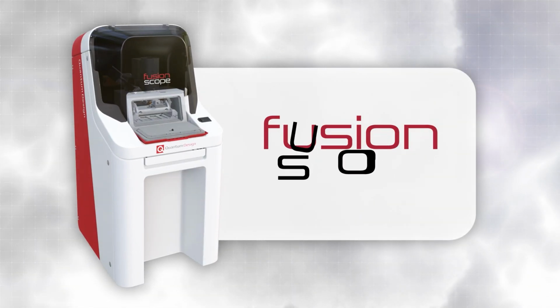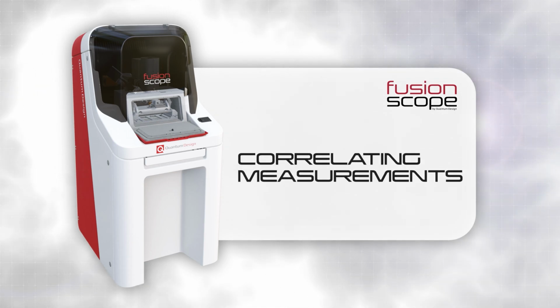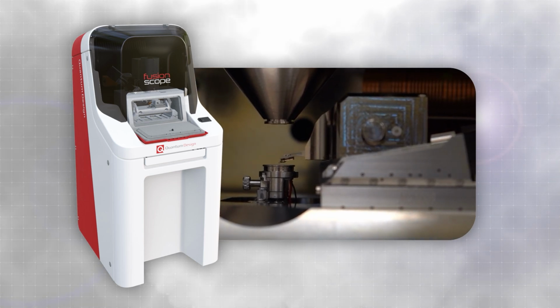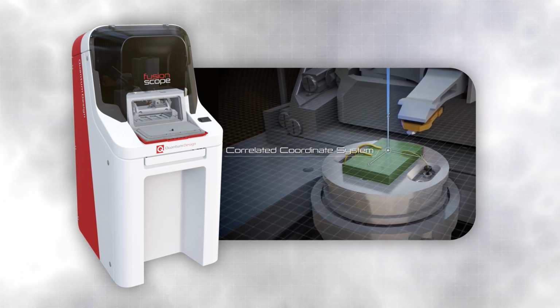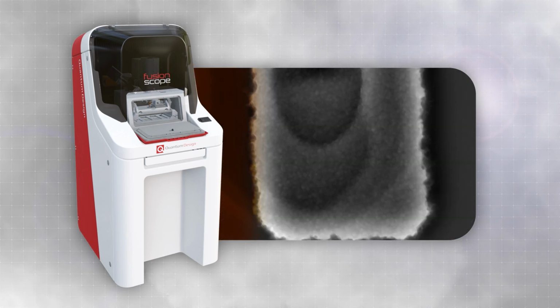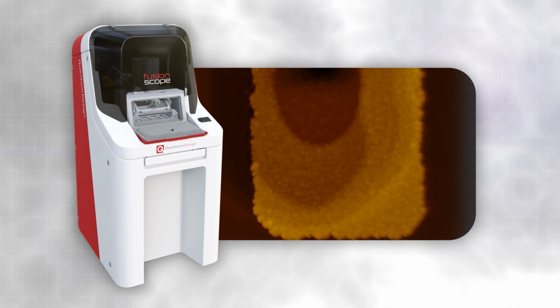Welcome to a FusionScope workflow video meant to demonstrate the process of data taking and analysis in the FusionScope. The key feature of the FusionScope is its ability to perform correlated measurements and thus leverage the strength of multiple different types of measurements in order to study a sample in ways that could not be done with only a single measurement technique. In this video, we'll be going over a very basic correlation between AFM, EDS, and SEM images of an interlayer via circuit.